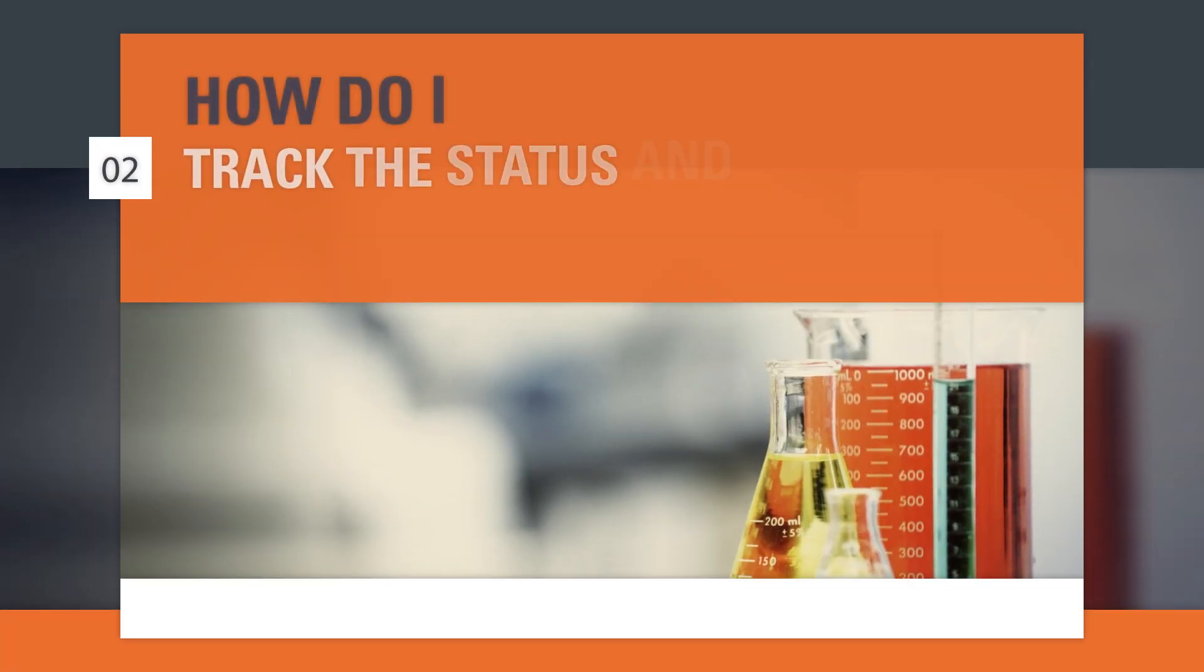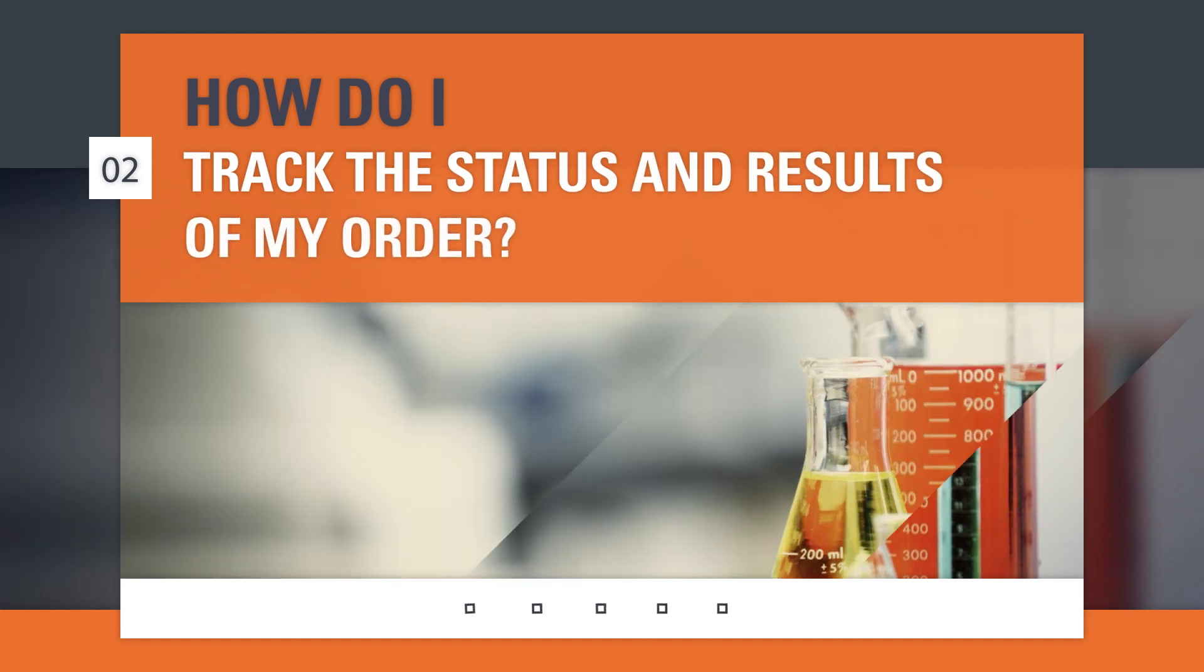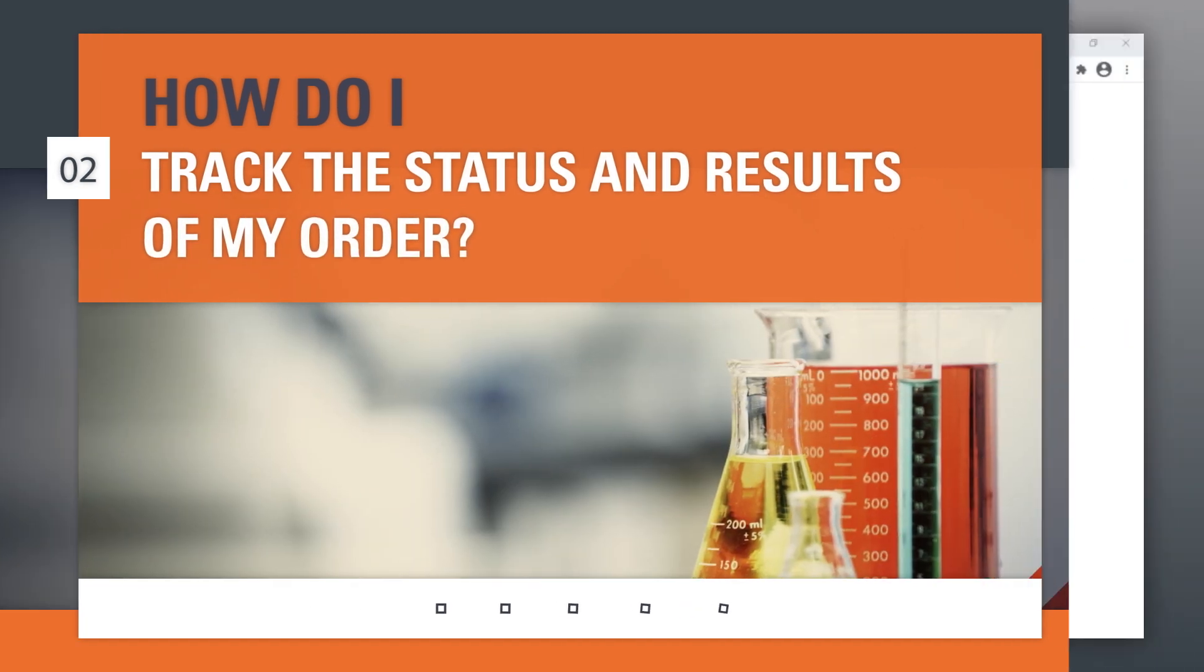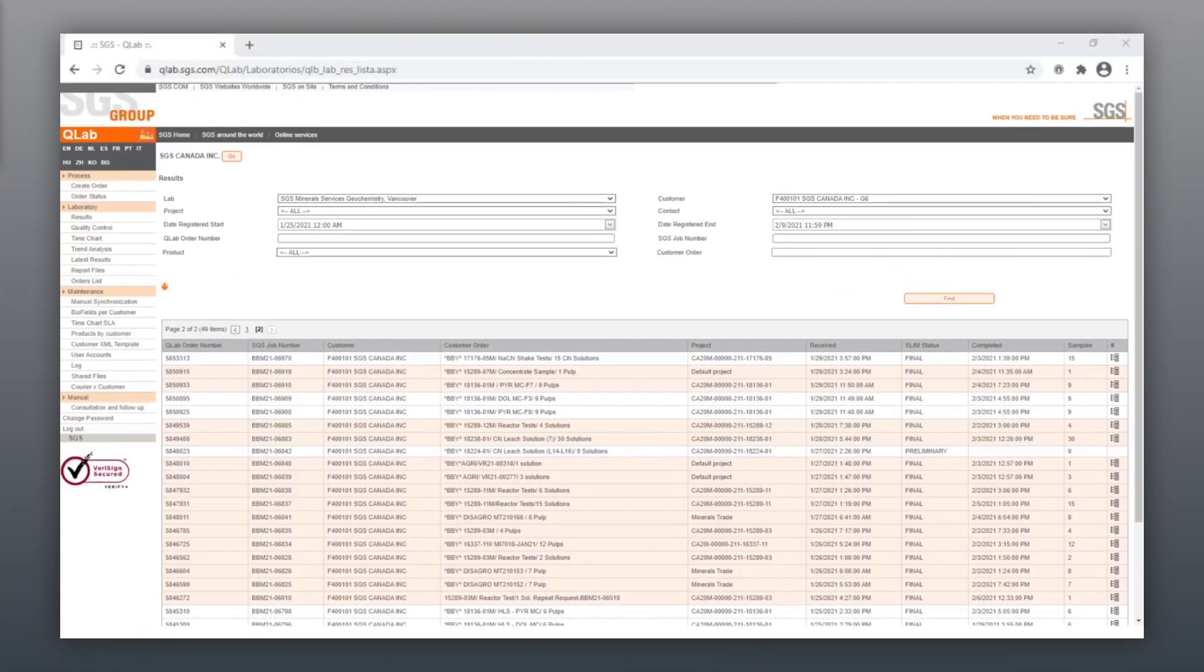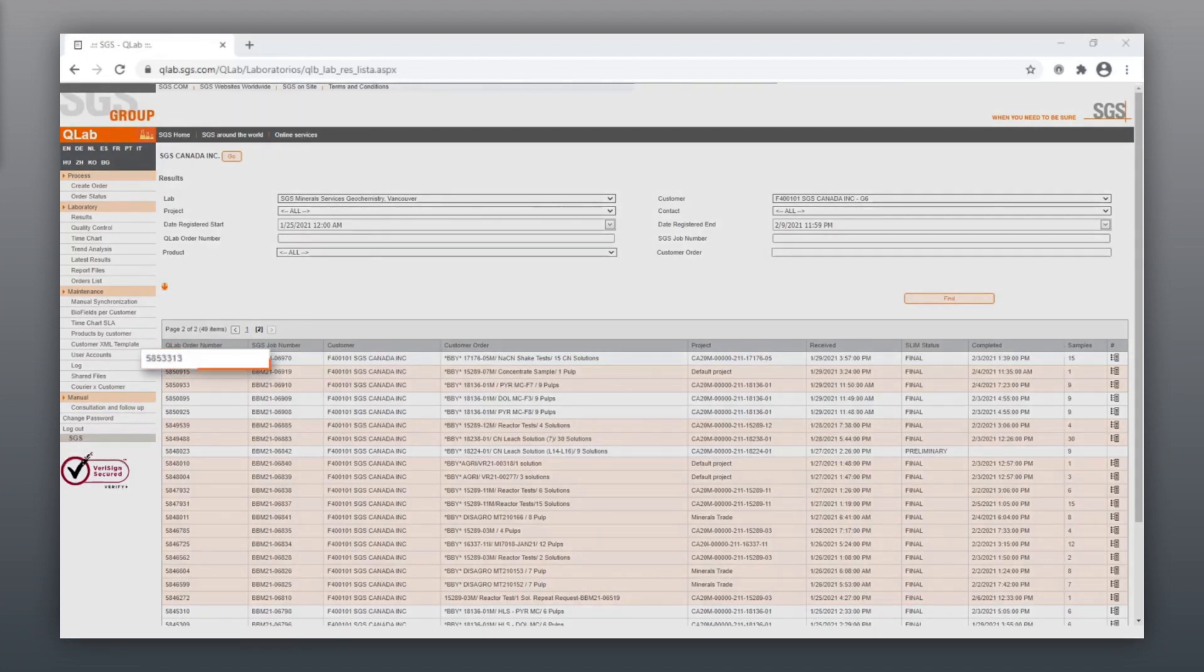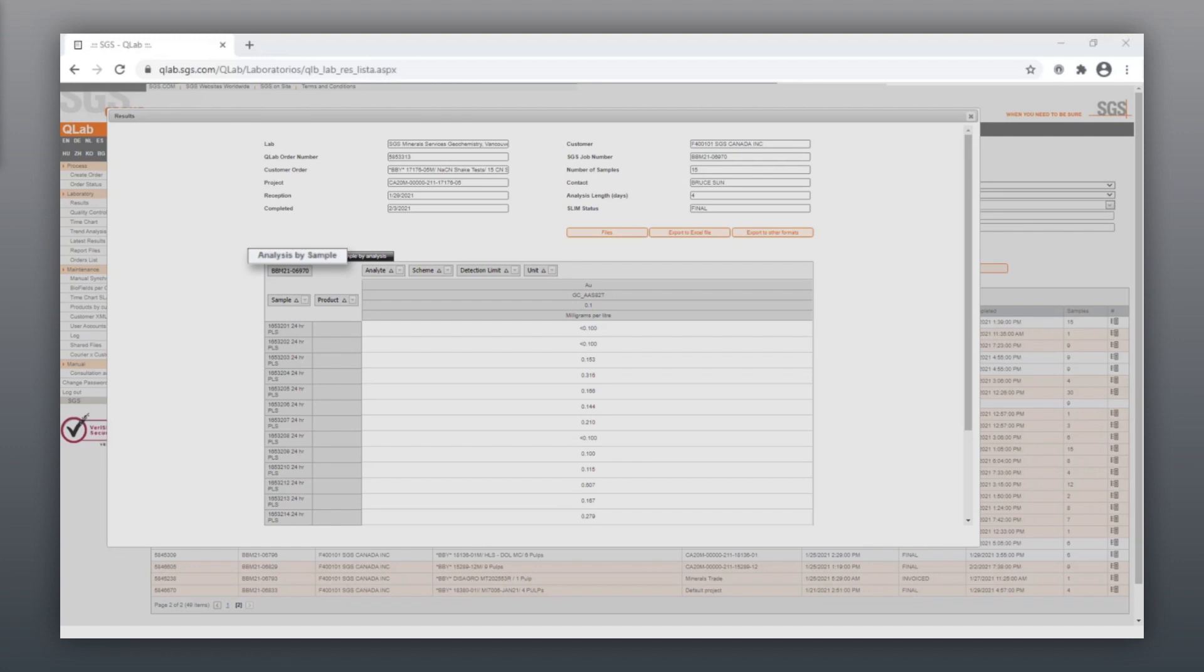How do I track the status and results of my order? Orders progress on QLab over the following statuses. Your default is Analysis by Samples or toggle the other tab Sample by Analysis.